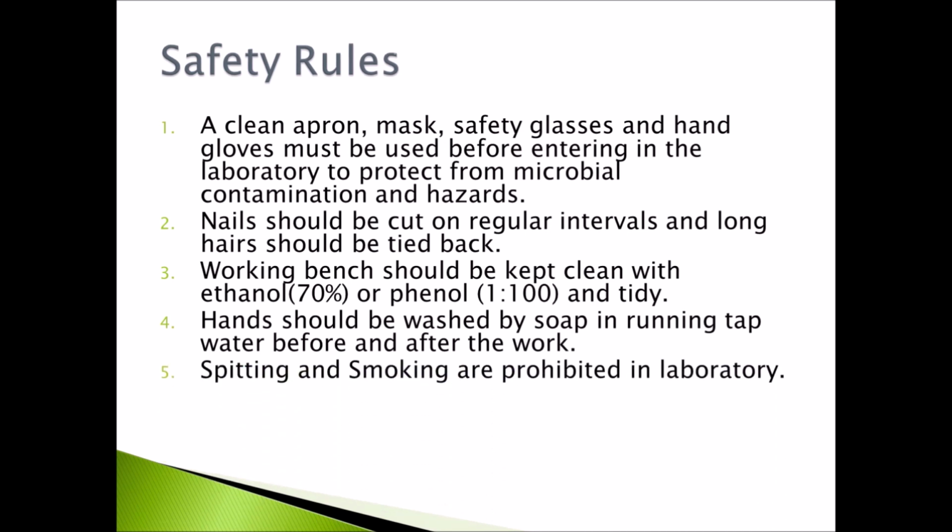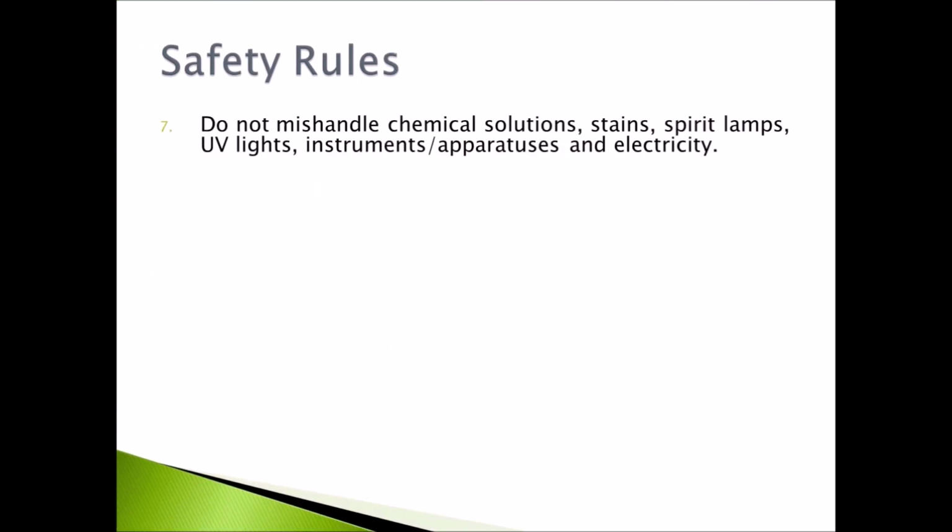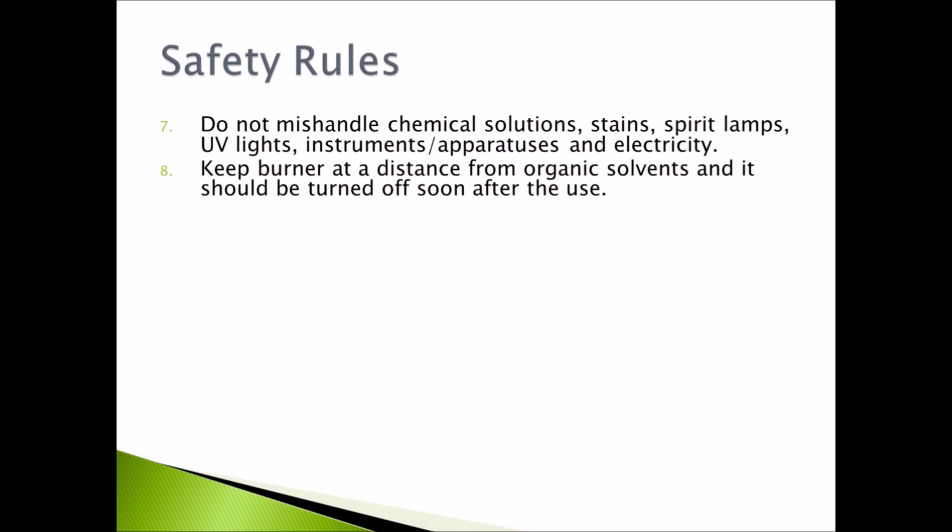Number five, spitting and smoking are prohibited in the laboratory. Number six, unnecessary activities like talking, eating, or touching the face, ear, nose, and eyes should be avoided. Number seven, do not mishandle chemical solutions, stains, spirit lamps, ultraviolet lights, instruments, apparatuses, and electricity. Keep the burner at a distance from organic solvents and it should be turned off soon after use.